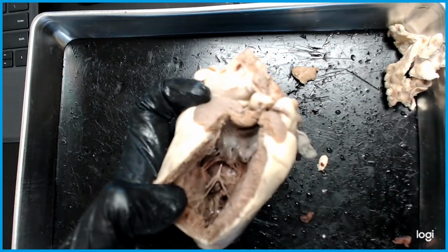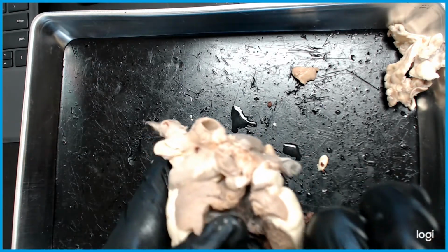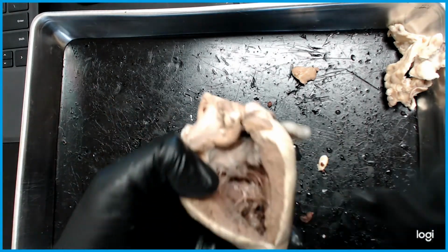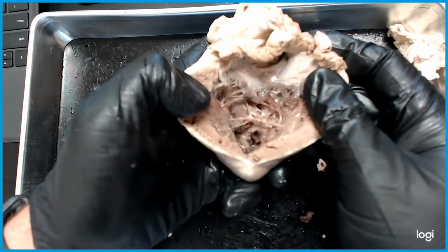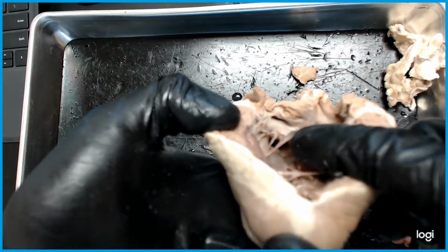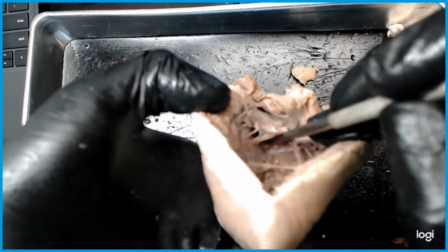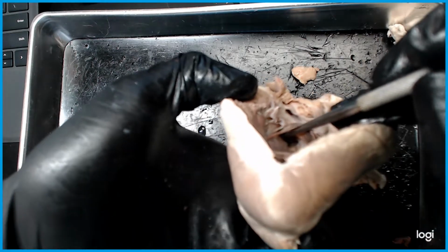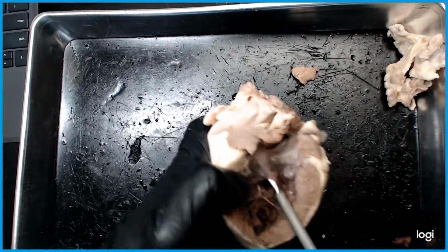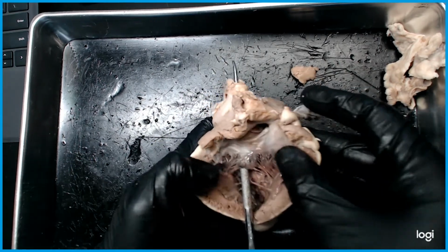So once we're at the left ventricle, it's going to shoot through the aortic valve, the aortic semilunar valve, and shoot to the aorta. Well, if I put my finger through, because it is the only opening, and this might be a little tricky for you guys when you first see it, you say, well, where's the opening? I don't really see anything. Behind the valve. And see, can you see that in there? Can I turn the light? Yeah, actually, let's go and turn on the light, see what we have. See that in there? Right there. If I push through, it comes up to the top. That's the aorta. So what I want to show you is the aortic semilunar valve, or the aortic valve.